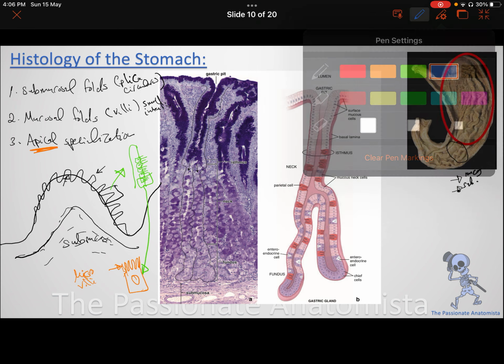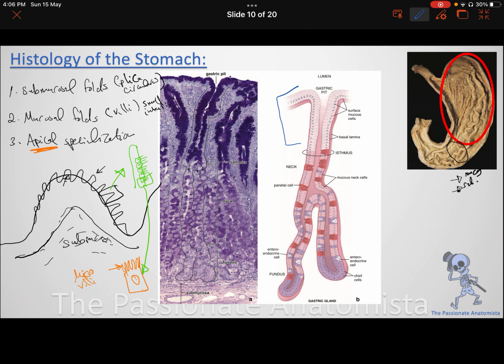All right, so here I have the gastric pit, and here I have the gastric gland. So what is the difference? In the gastric pits, this is actually your surface mucus cells. They are important to secrete mucus that will help to protect my epithelial lining from mechanical and chemical injury while I digest the food. So it's very important to have mucosa up there. Now, down, I have the gastric gland itself.